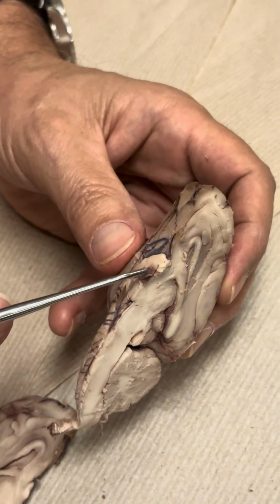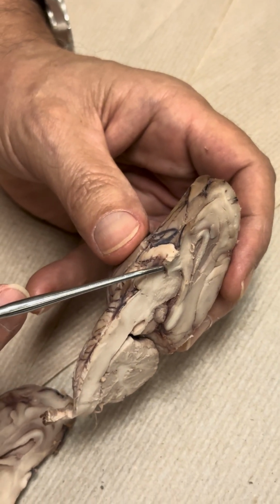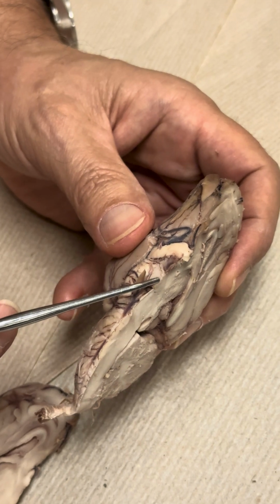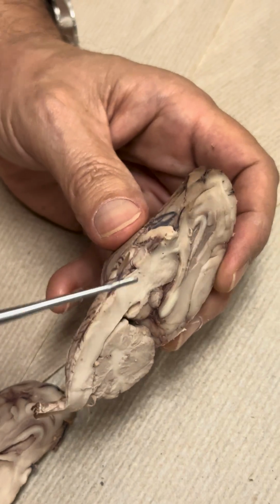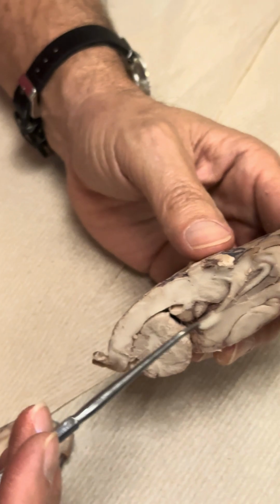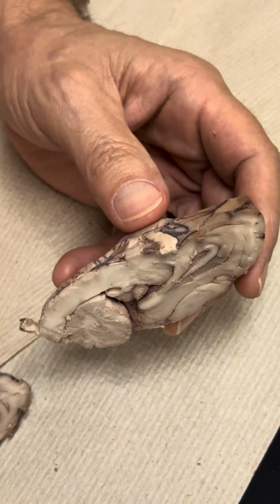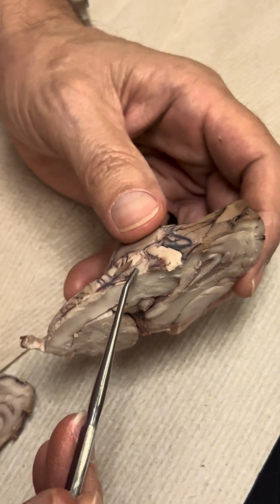All right, the pituitary gland hangs down from the infundibulum right here. That dark brown stuff is the infundibulum. Then it turns white. That's part of the hypothalamus. It's called the mammillary body. The titty. You got it. We actually have occasionally a sheep brain that has both of them, two titties. The human brain does have a mammillary body on each side. Now, occasionally we have a sheep brain that will show that.